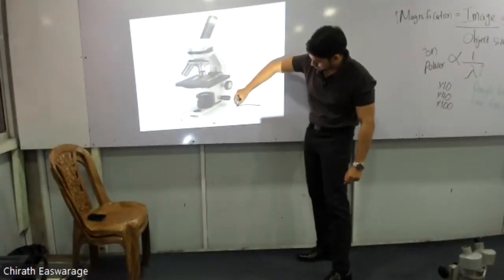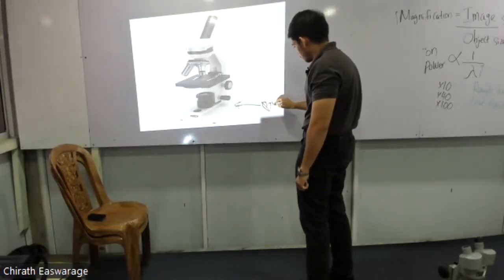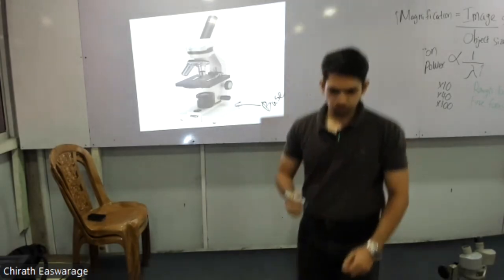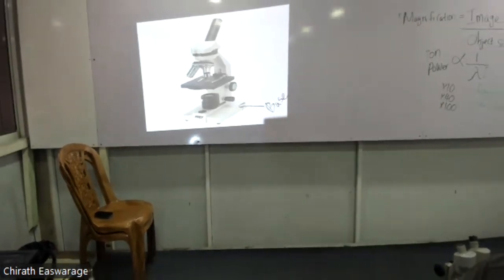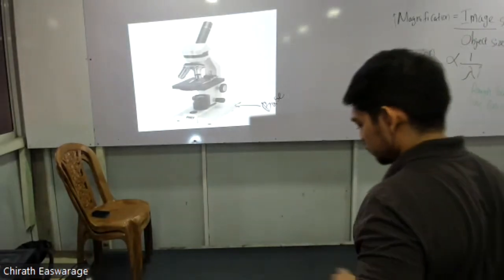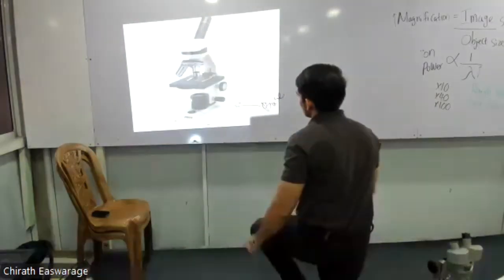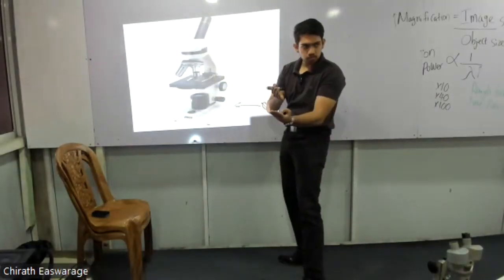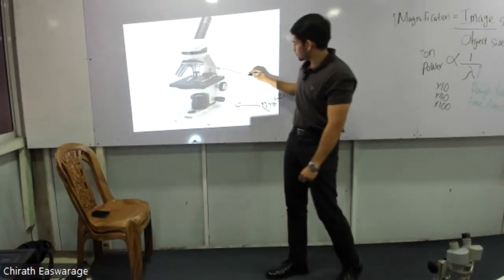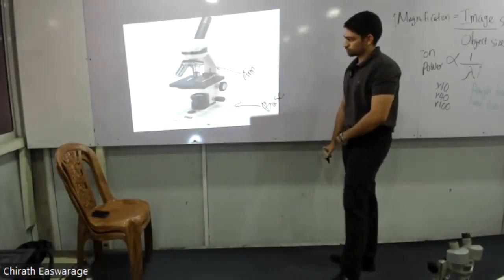This is the base, right? Then the base supports and we hold it from the, label with me, arm. Base and arm.